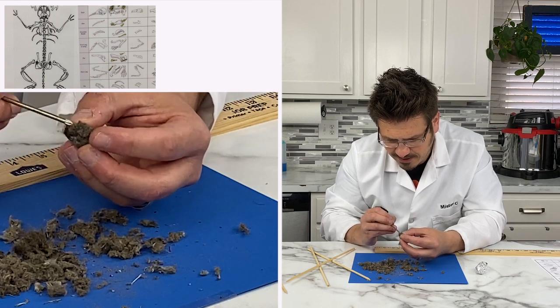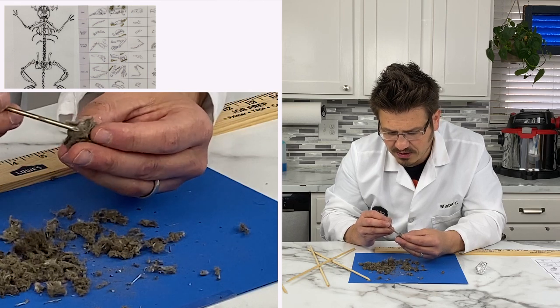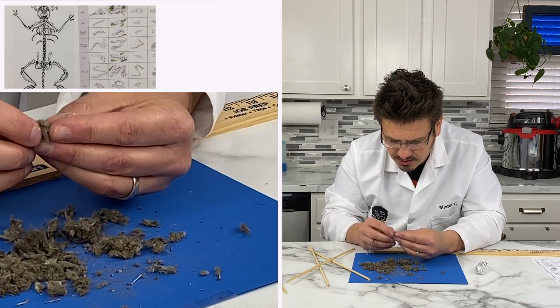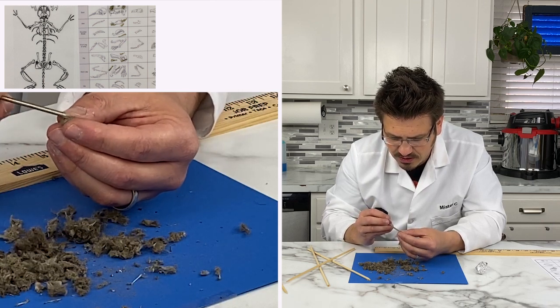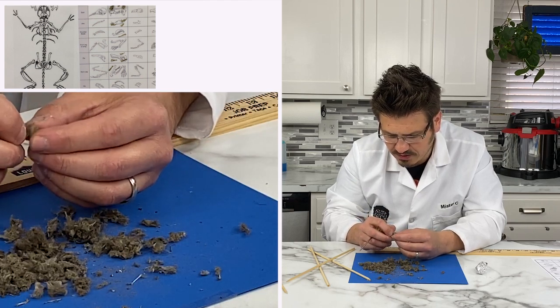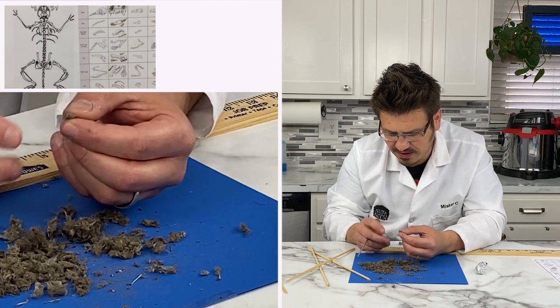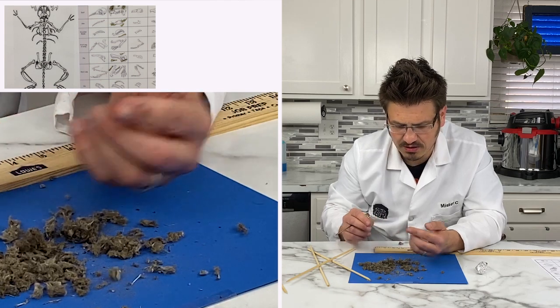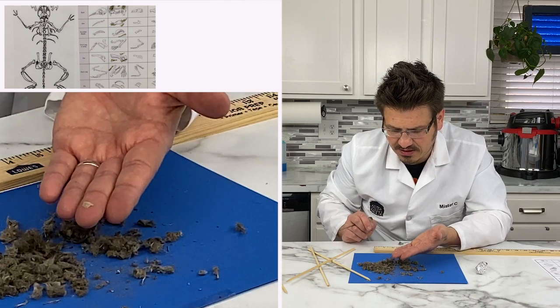Come on. Ooh, it's really tough. I could have sprayed it with a little bit of water. Oh my gosh. No. What is this? No, I don't think it's a full skull. I think it's part of a skull, but I don't know if it's part of the other one. Oh, my fingers. So it definitely looks like it's part of the skull, but it's not a whole part. There's a little piece of the skull.